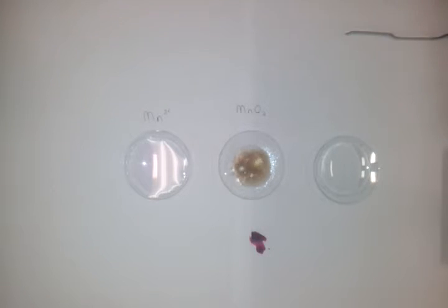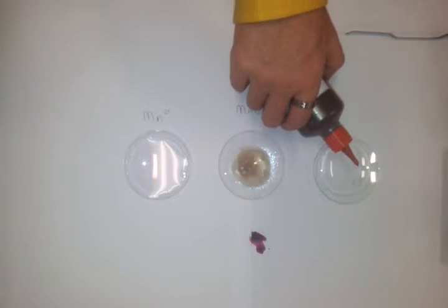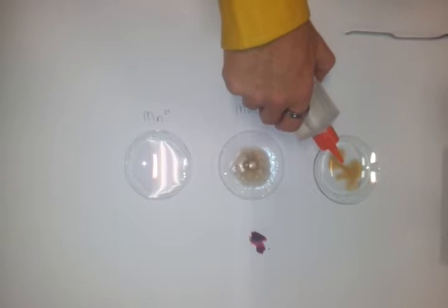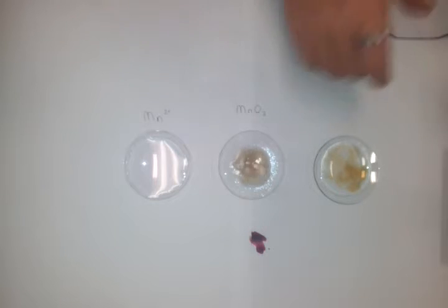So in this last one, which is going to be, sorry, not acidic, alkaline conditions, here's where I'm hoping I've put enough sodium hydroxide in to give you another result, and maybe I haven't because it's made that brown. So I might need to add just a little bit more base there to get the right result. No, I might have to do that one again.